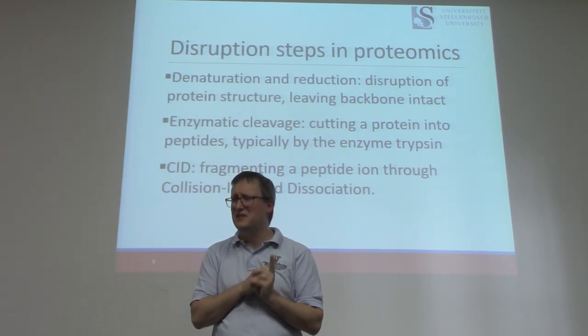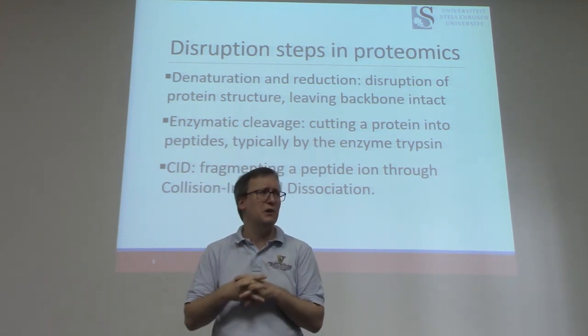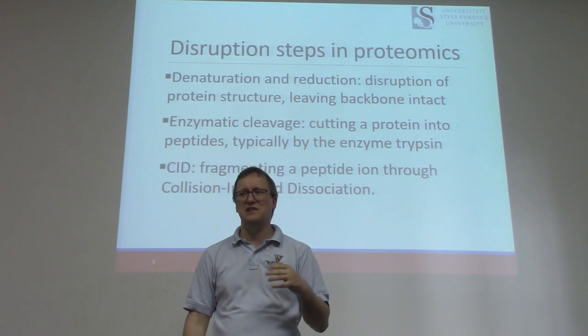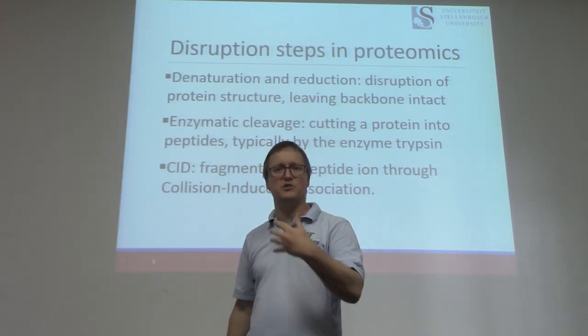It sometimes goes under different names, and there are some slight variations in how it is performed. One of the most popular ones that we hear in the Western Cape is HCD, or higher energy collision-induced dissociation, but it's really just CID with a little bit more energy behind it, and the energy directed somewhat differently. So a lot of this stuff comes around CID.